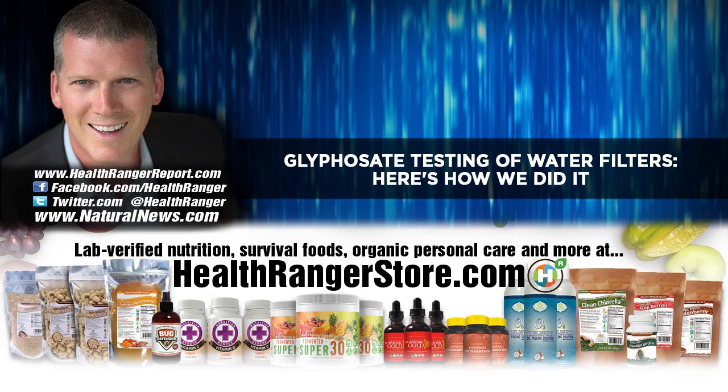Now, the metal ion contamination of the solvents can still cause problems. So you have to know how to eliminate those metal ions, and there is a process and a chemistry for achieving that. So we have to do that every once in a while, but especially if we hit this column with a very, very high concentration of glyphosate. Like if you're hitting it with, let's say, 10 parts per million, you are going to get some nasty carryover effects unless you know how to clean out the column and eliminate the metal ions and whatever glyphosate is chelating itself to the metal ions as well.